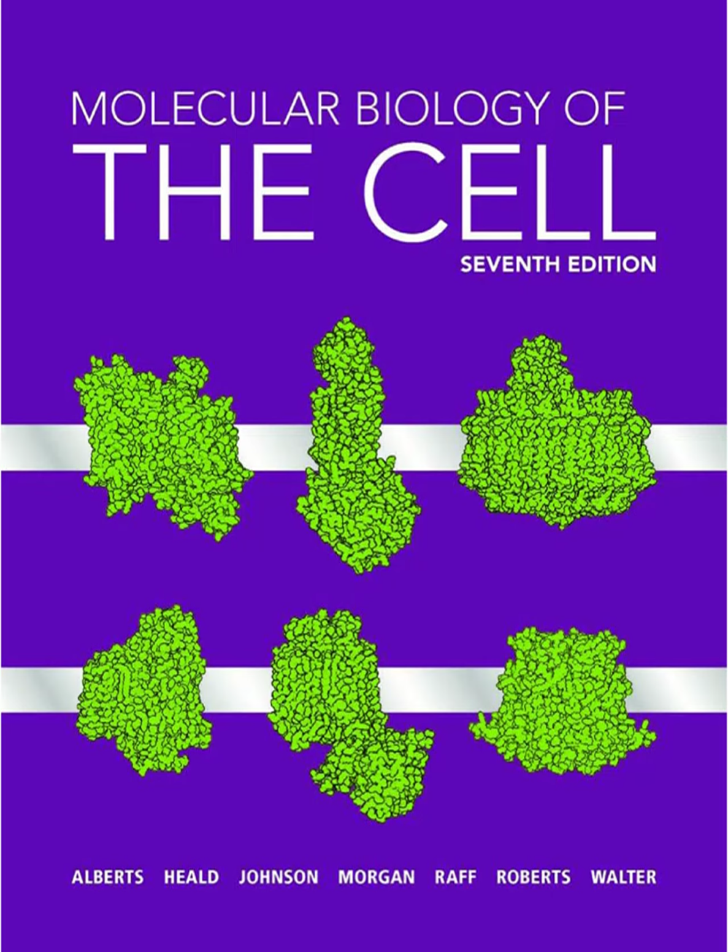These heavy atoms bind non-specifically to various cellular components, increasing their electron density and making them visible against the background. So it's basically heavy metal staining. Pretty much. Different structures pick up the stains differently, giving you the characteristic EM contrast. Are there other ways to get contrast, especially for isolated molecules?